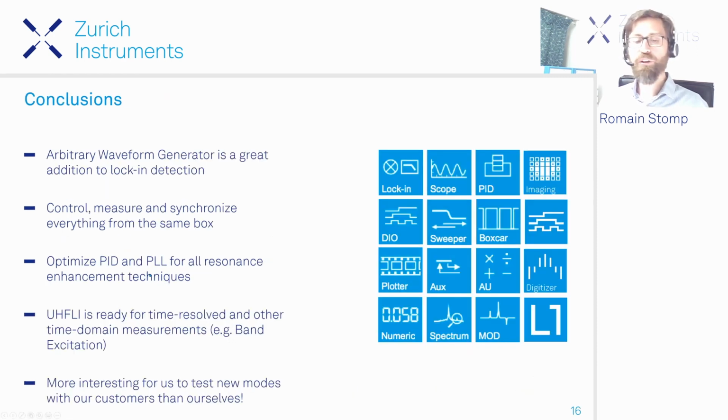But basically, everything that we have shown works the same way if you just introduce this delay too. Okay, so let's jump to conclusion. So I hope I could convince you that an arbitrary waveform generator is a great addition to lock-in detection.